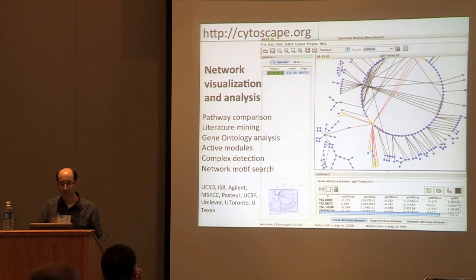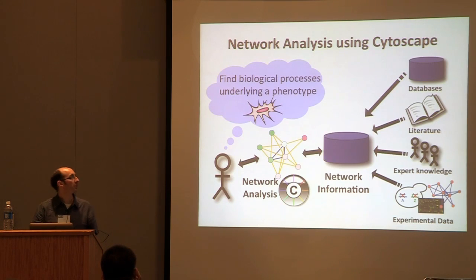It's probably one of the more popular ones that's out there now, and that's been useful because people have contributed a lot of interesting features to the system. So the idea with Cytoscape is that it's like a visualizer. You have to load in data, either network data that you have. So for instance, if you have a correlation network, you could visualize that in Cytoscape. That's where you're starting with a network and you can visualize it.